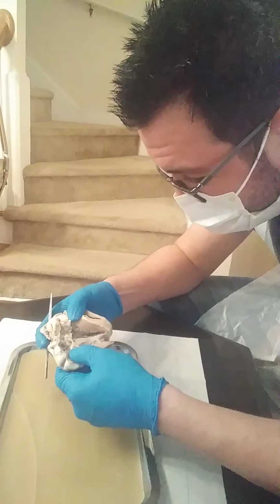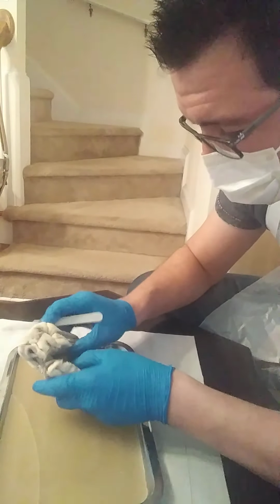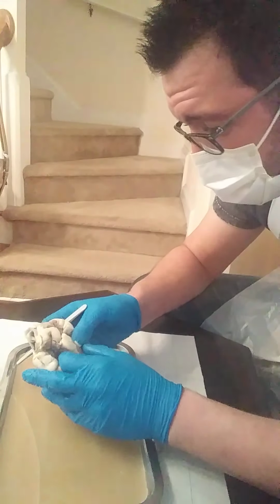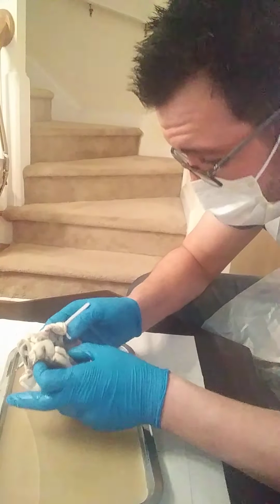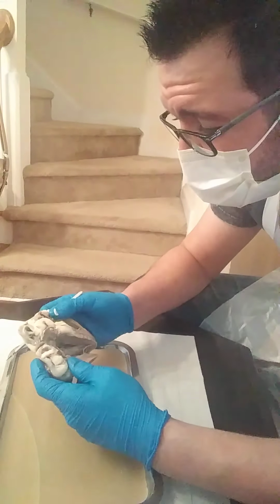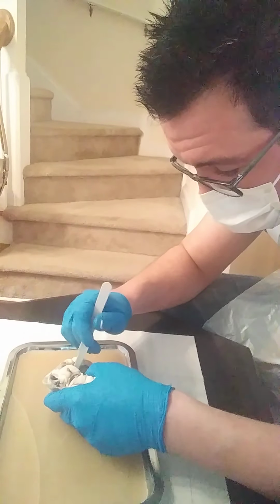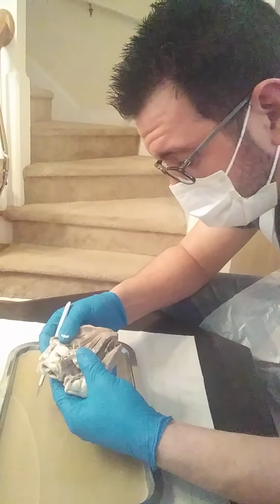Very interesting stuff, truly. It's an amazing thing. Yep. This is the interventricular septum. The left ventricle. And the atrium. Yep, there it is. Not the atrium, the auricles, right? Auricle, because it's an animal. So, fascinating stuff.